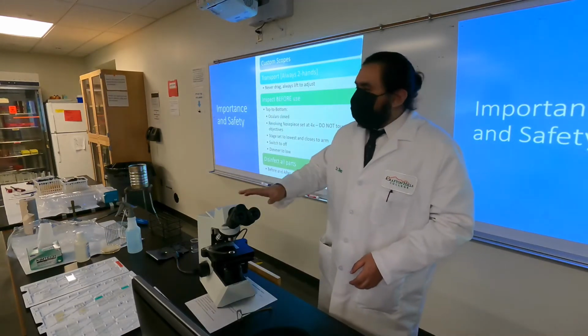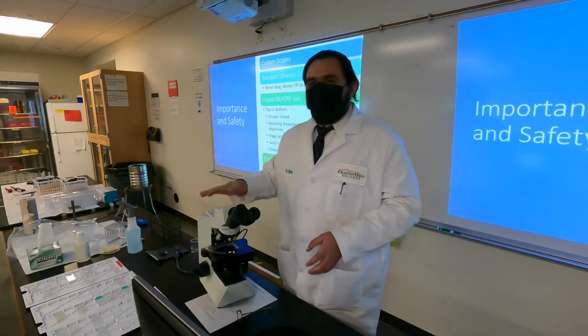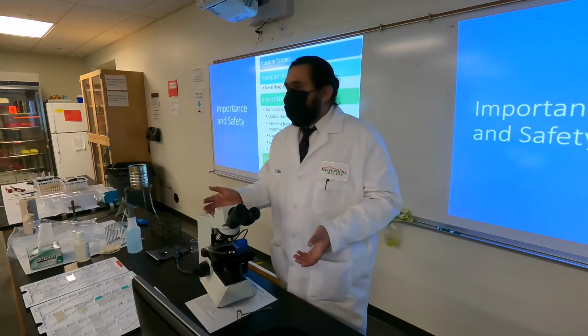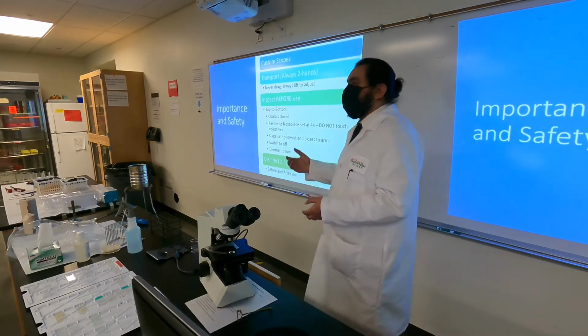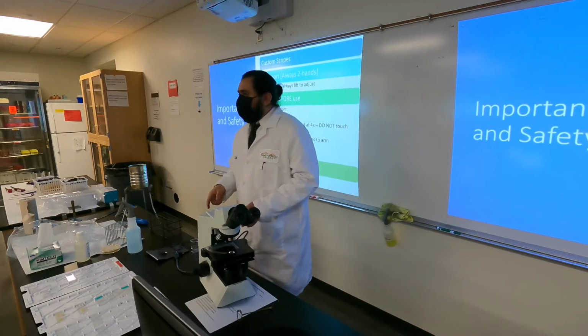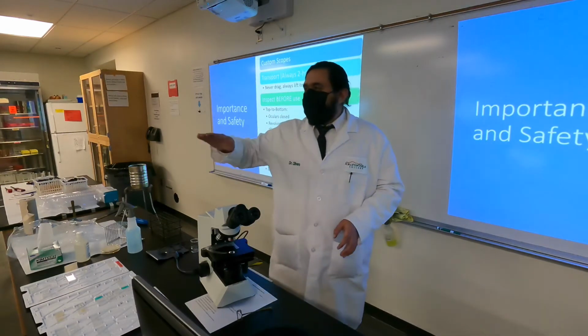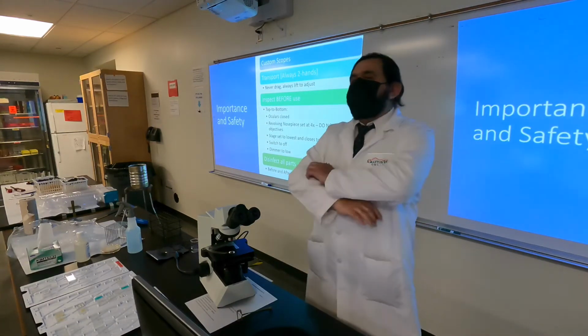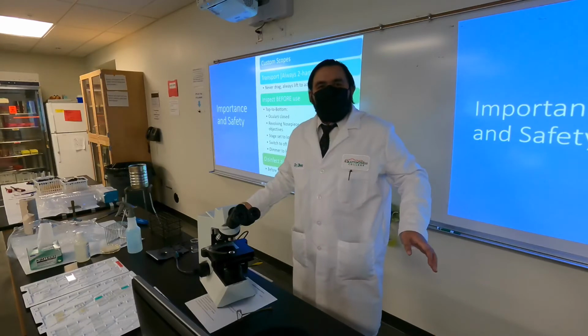Now, what we want to do also, before we do whatever we're gonna do, is specifically inspect it. Again, trust no one. We don't know who was the person that used it before you, and you're gonna get the blame if you damage it now. So then the idea is we're gonna inspect it based on the lab manual, the lab supplement, top to bottom, before we touch anything about it, right?